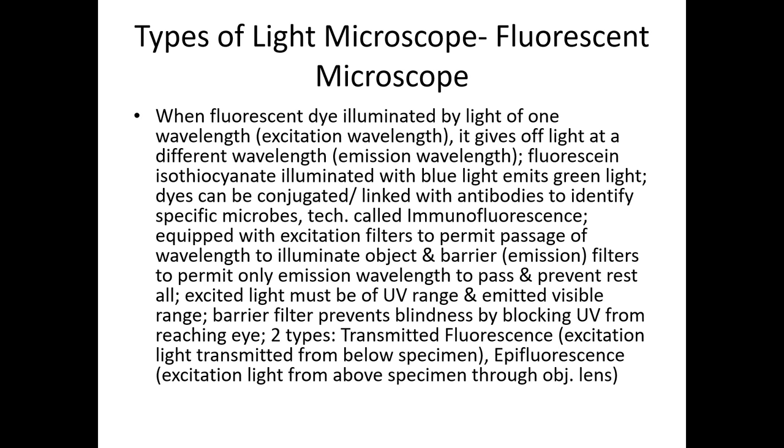Fine. Fluorescent microscope is equipped with excitation filters to permit passage of wavelength to illuminate the object, and the barrier filter, emission filter is otherwise known as barrier filter, which will permit only emission wavelength to pass and prevent all others. So that is a safety feature of fluorescent microscope. Why?